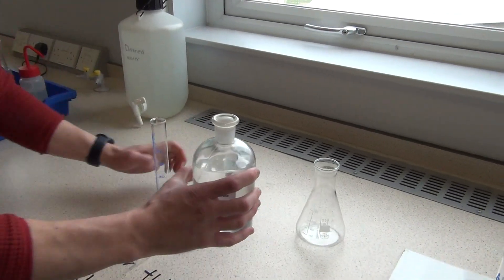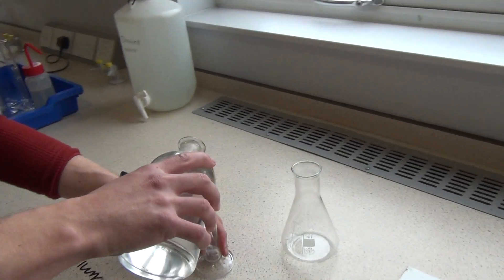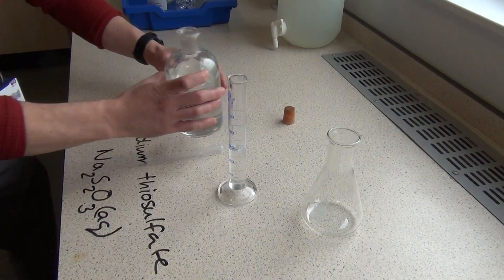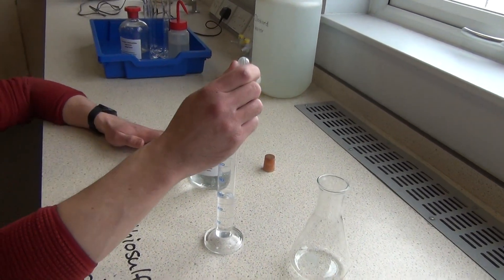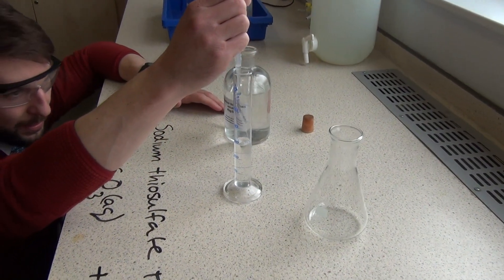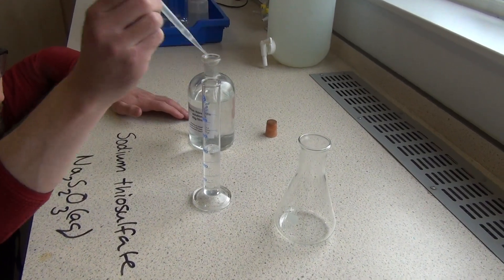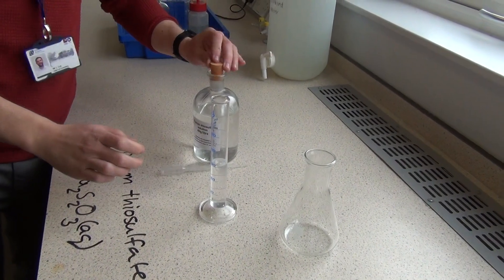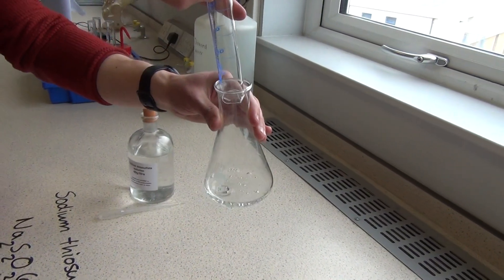First thing I'm going to do is measure about 30 centimeters cubed of the sodium thiosulfate using a measuring cylinder. Always name the equipment you use in your method. I want to make sure that the level of that liquid is right on the mark where the meniscus is at the line, the base of the meniscus is on the graduated line, so that's good. Right, so I've got 30 centimeters cubed of the sodium thiosulfate, I'm going to put that into the conical flask.